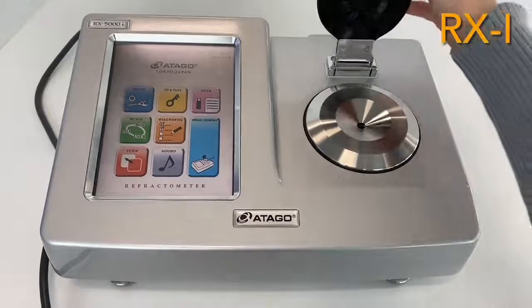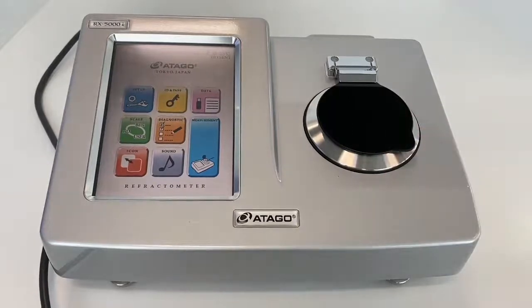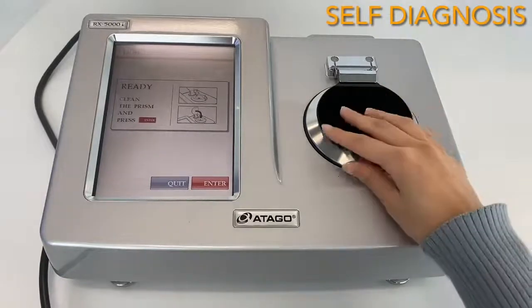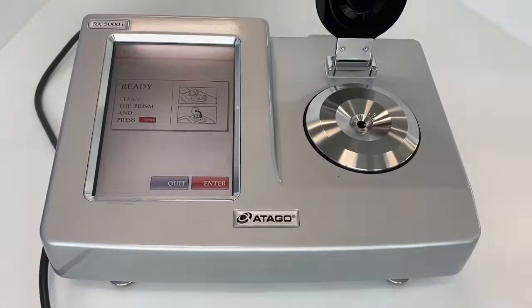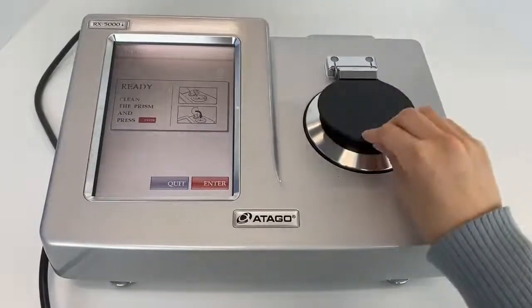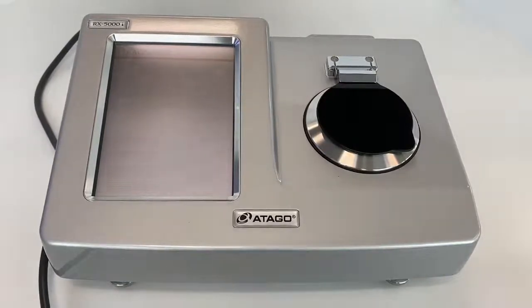Moving on to RxI — as you can see, this is the touchscreen style. You don't have to click buttons like with Rxα; you just press the icons to change the screen. This is the self-diagnosis function, which only RxI has. First, you clean the sample stage and the prism with water. It is important to clean the sample stage before running self-diagnosis. This system checks the condition of the instrument — whether there is any build-up on the sample stage or any damage on the prism.